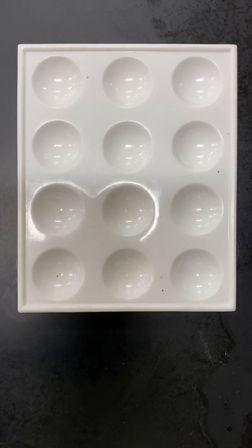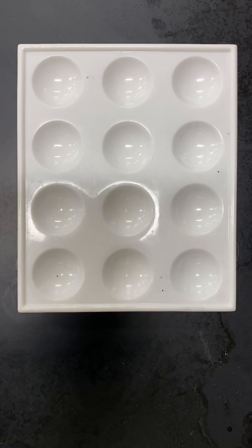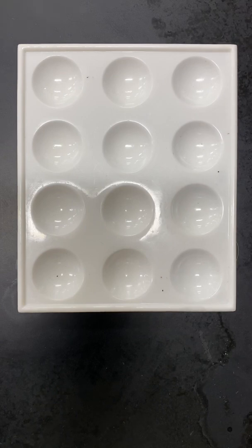Okay, so today I'm going to be running through Activity 1, the effect of enzyme concentration on reaction, for the enzyme lab that we're working on in class. For those of you that were virtual, this is part 1. So what I have to work with is starch, diastase, the iodine indicator solution, and deionized water.